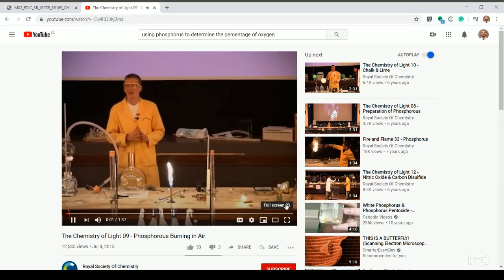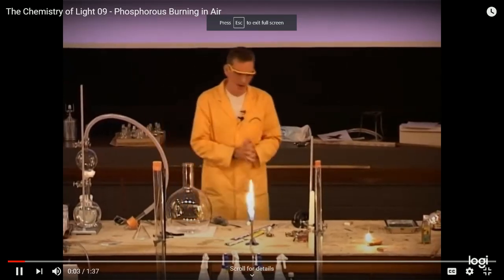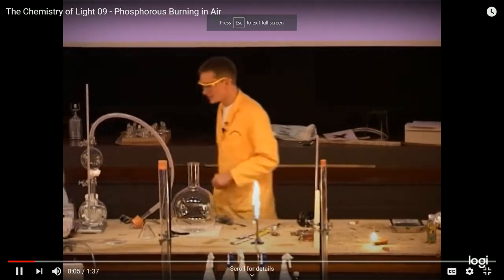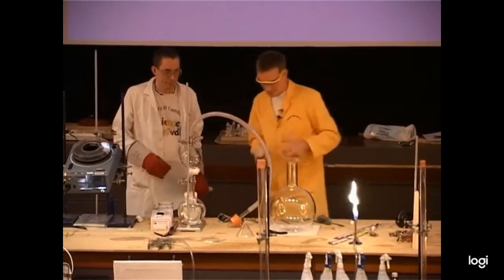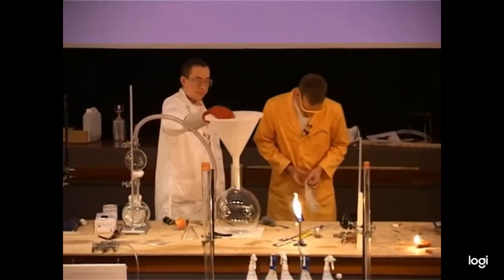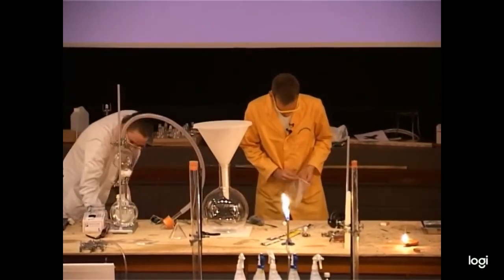Here we go. I thought we ought to demonstrate this to just show you how reactive phosphorus really is. I'm going to get some phosphorus in a second. It's really rather unpleasant stuff so I need to put on my gloves here.